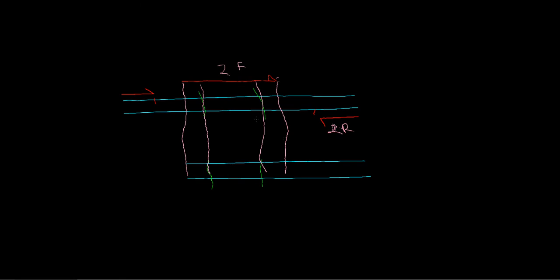But for the first half, the first chunk, we're going to need a reverse primer. And the combination of, we'll call this reverse primer 1R, and our forward primer 1F. The combination of these primers is going to give us another chunk of DNA.